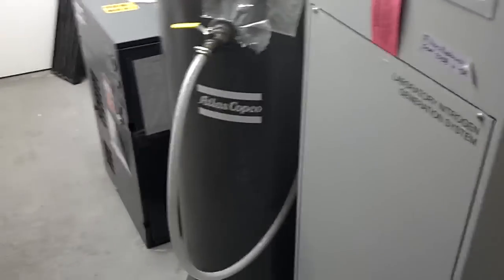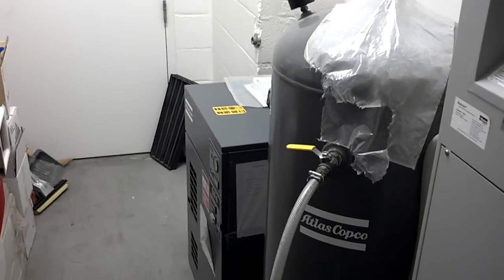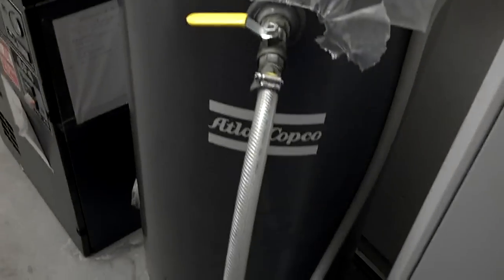So, this is the tool room. This is also our nitrogen generating apparatus. This pulls air in and scrubs it. And condenses nitrogen, which we use in our machines, which runs through this tube here, up through the roof to the machines, which you'll see in a minute.